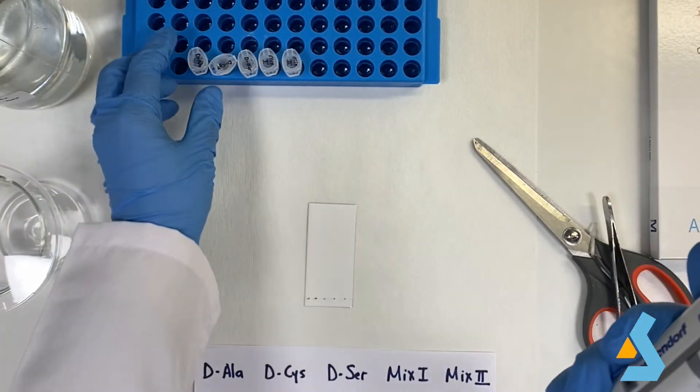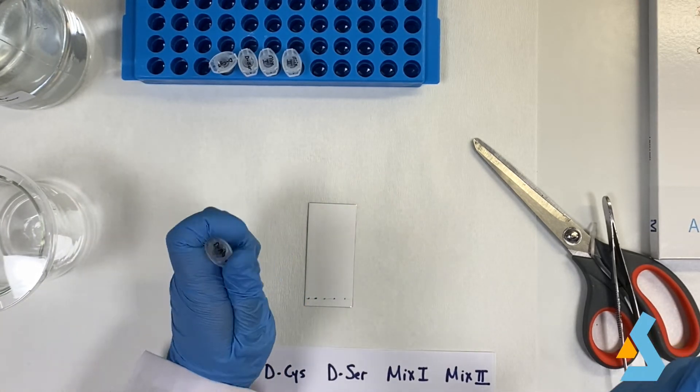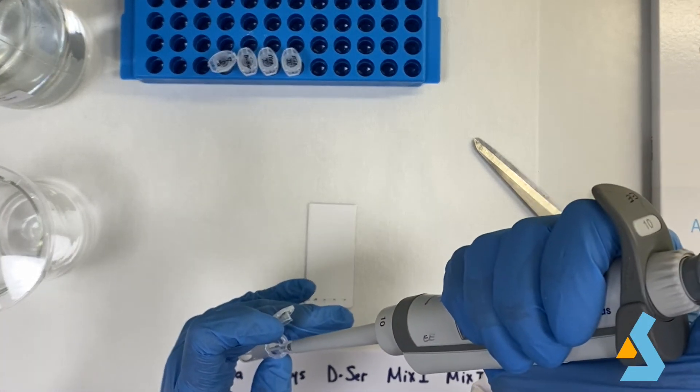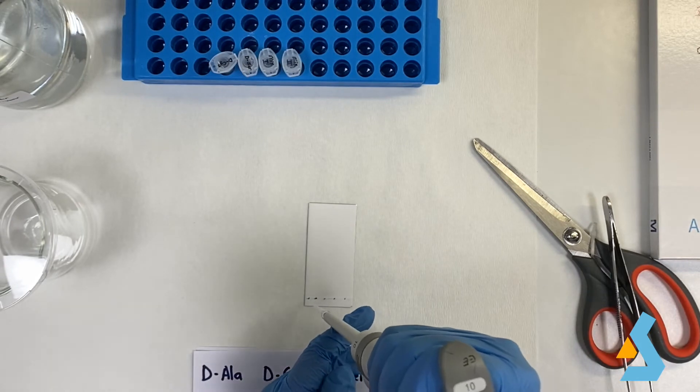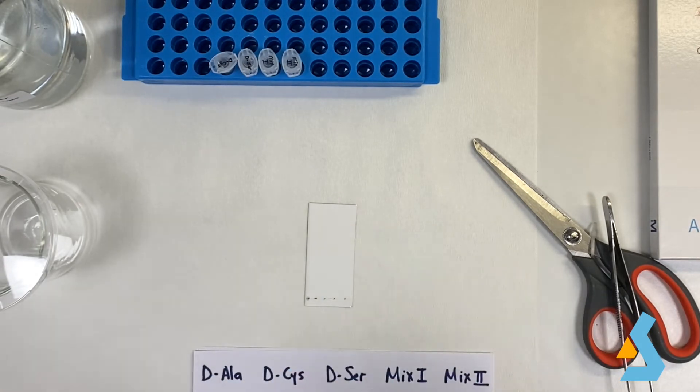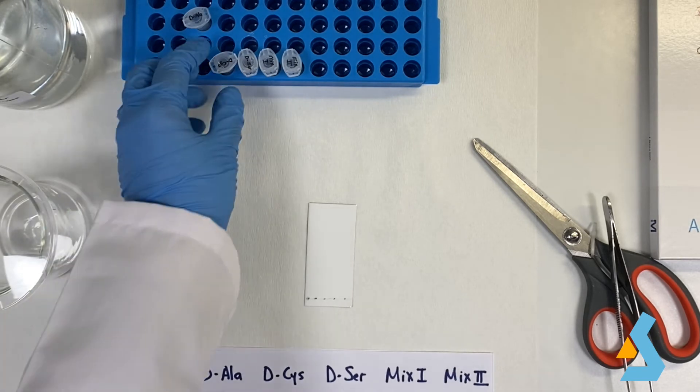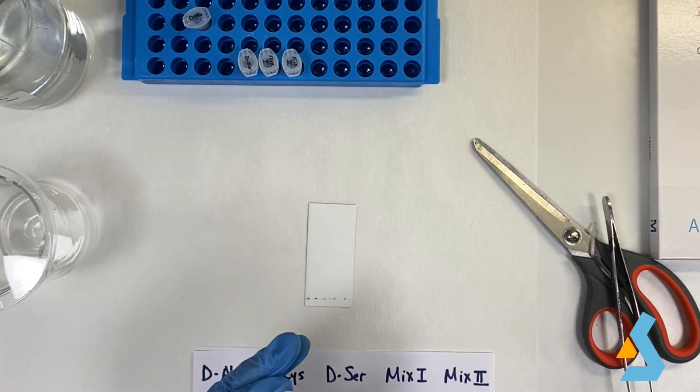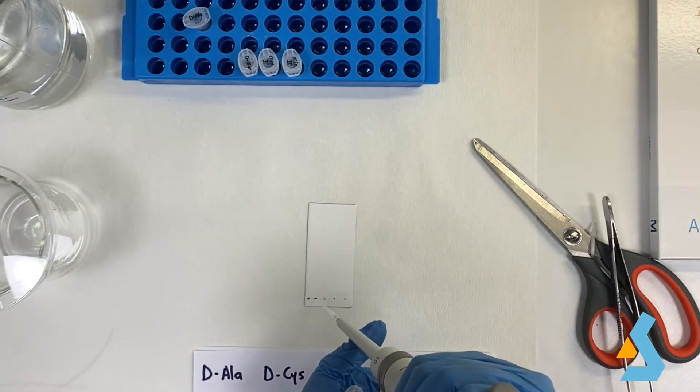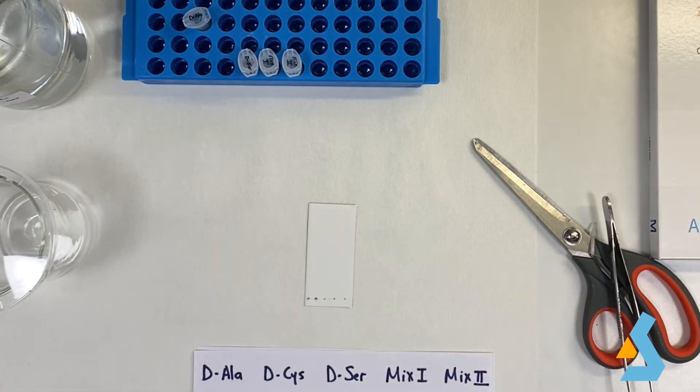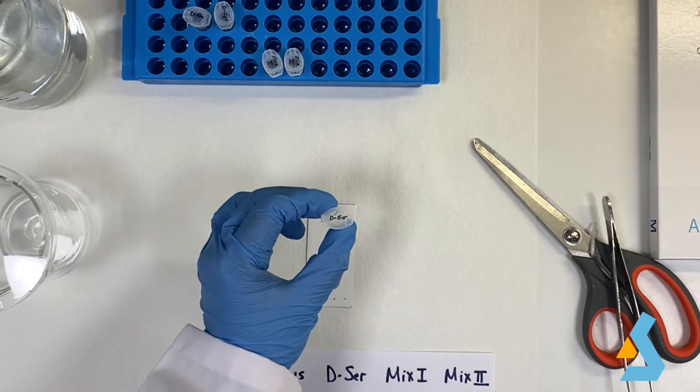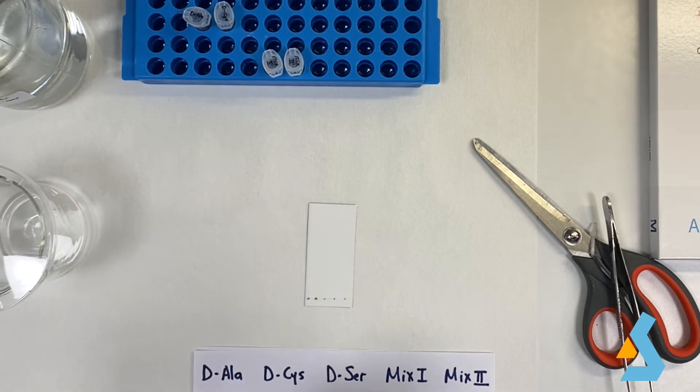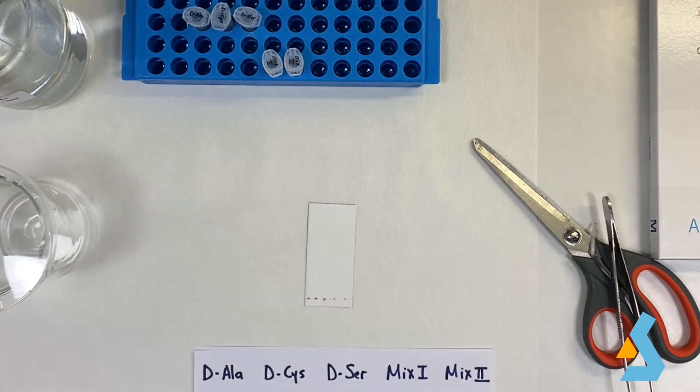In this experiment, we will have five samples. We add one microliter of samples to each spot. The sample solutions all have two milligrams of amino acid per milliliter. The first sample is D-alanine, the second one is D-cysteine, the third one is D-serine, and the rest of the two samples have unknown mixtures with one or two of these D-amino acids. We will identify the content of these unknown mixtures at the end of the video.